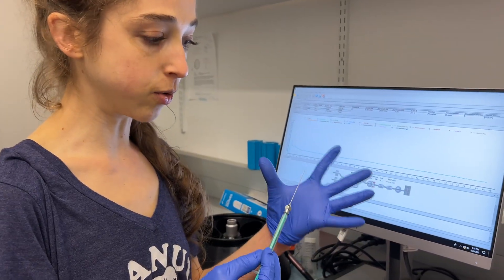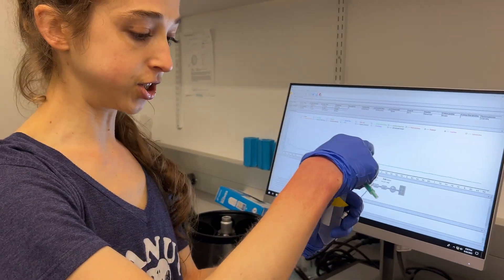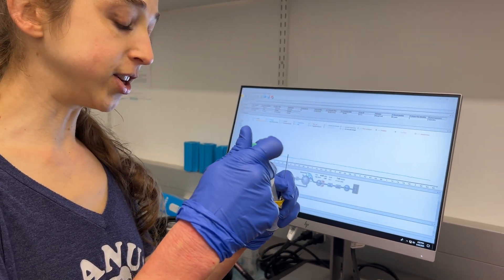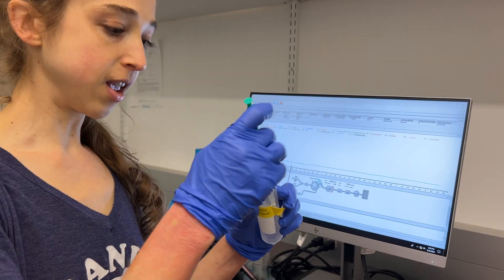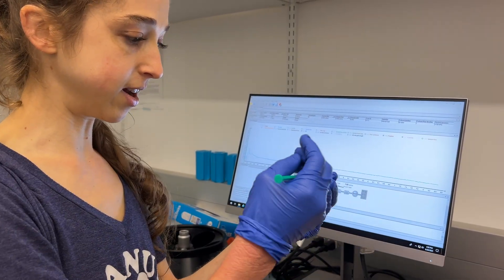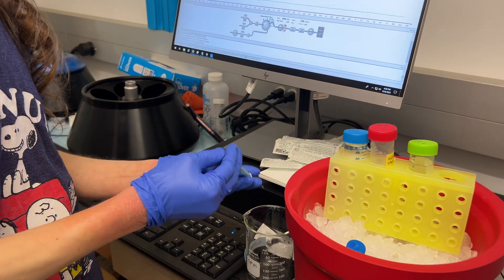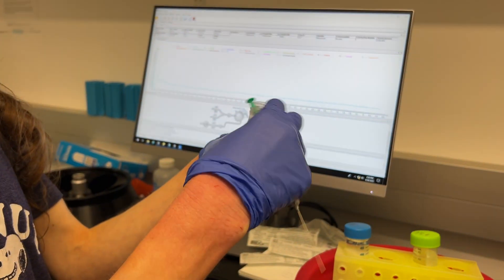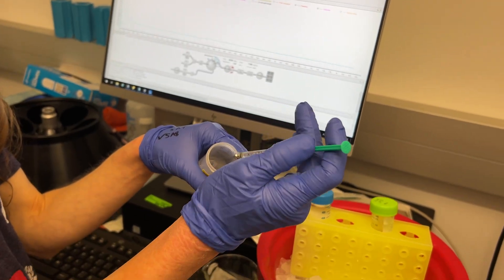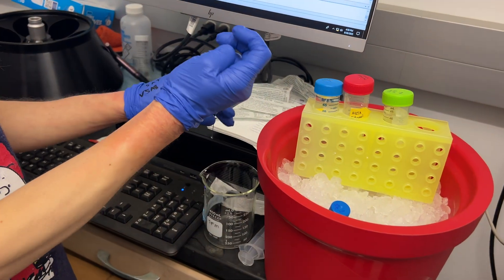First, what you're going to want to do is wash it. Typically what I do is a couple of washes with 20% ethanol. Anything that you put onto the ÄKTA, you want to make sure is filtered. I'm just going to go in and then push it through and into the waste. You can actually do it up through the needle as well — I just like to do it once out through the needle before I do this. And now I'm going to wash the needle with ethanol a couple of times.